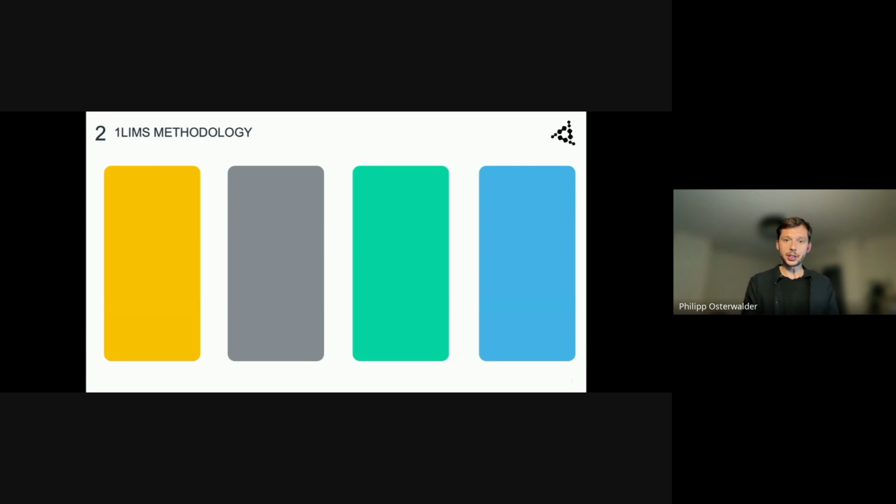Next, our methodology, how we proceed, is already explained in this last chart. So I want to have a short recap. The first step that is needed and necessary is the assessment of the current state, based on the quantification of the laboratory quality and company KPIs which are related or important to them, and also to create the process map to understand how the workflow is working, what the format is, what the goal is, what the communication ways are, who the responsible people within these workflows are, and what the touch points are.